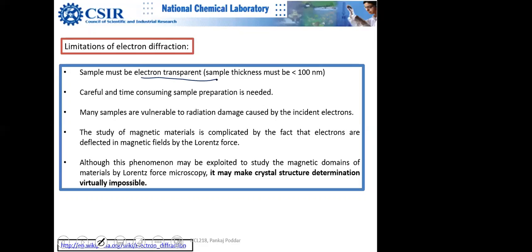We will take some questions now, and then I will open the SEM presentation, because I promised that. Sample preparation is very time consuming in TEM. In SEM it is not. SEM's sample preparation is rather easy. You just have to coat a thin metallic layer for electron conduction, and you're all set.